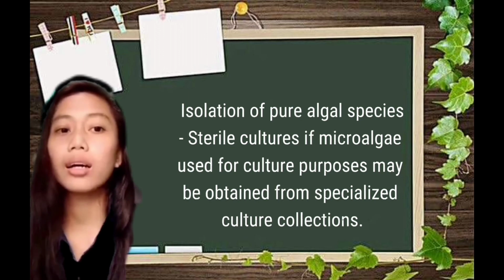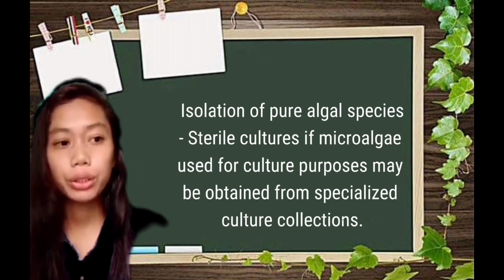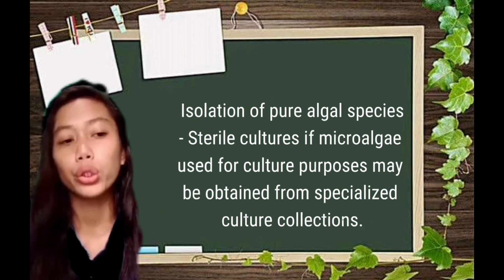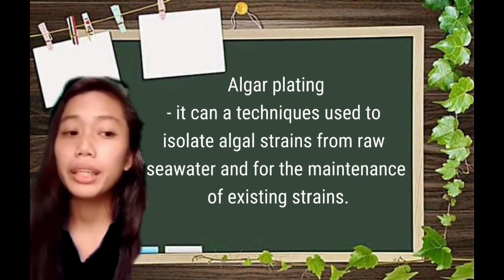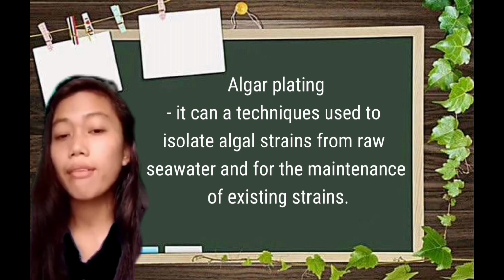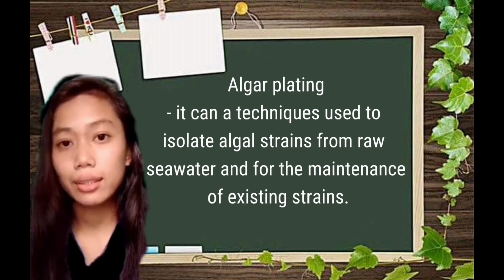Isolation of pure algal strains. Sterile cultures of microalgae used for culture purposes may be obtained from specialized culture collections. Agar plating techniques can be used to isolate algal strains from raw seawater and for the maintenance of existing strains.